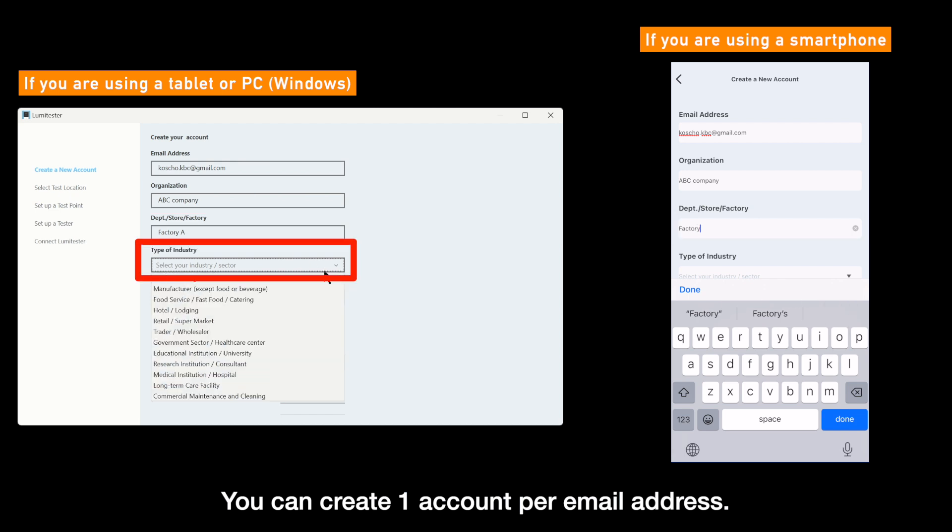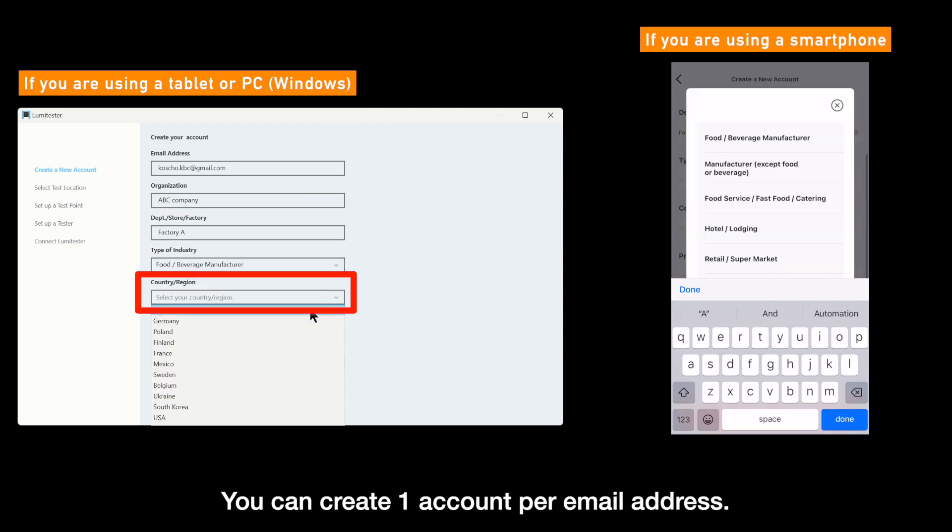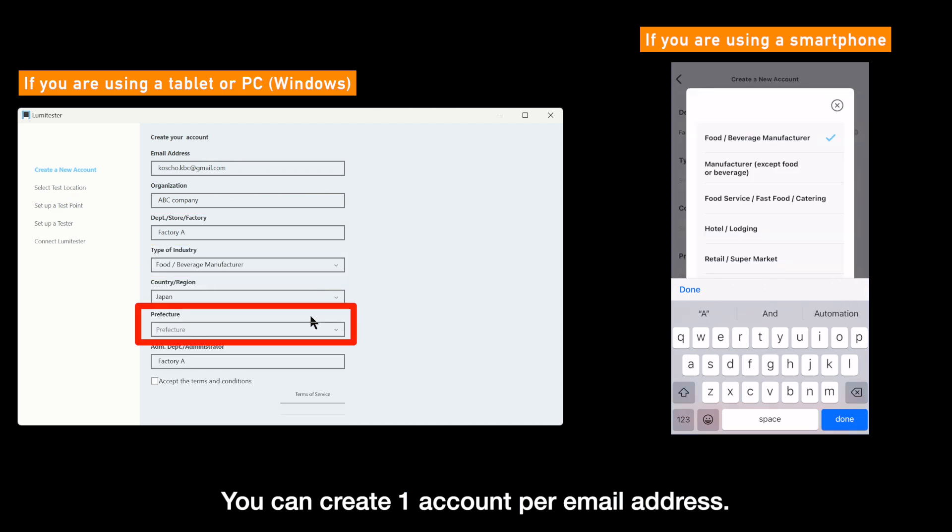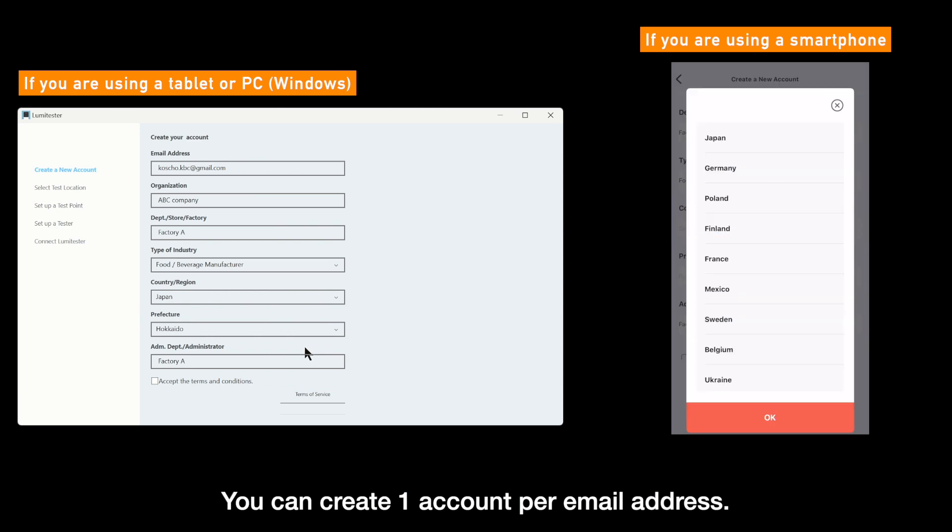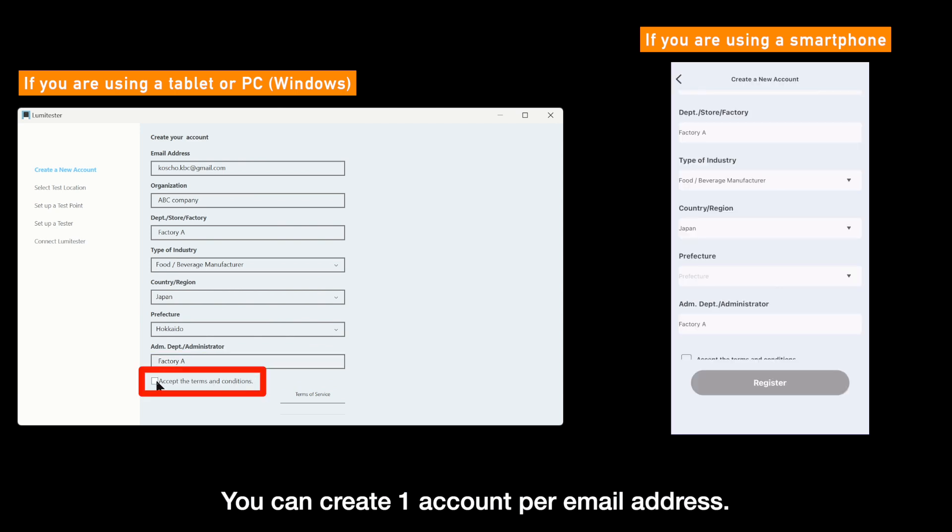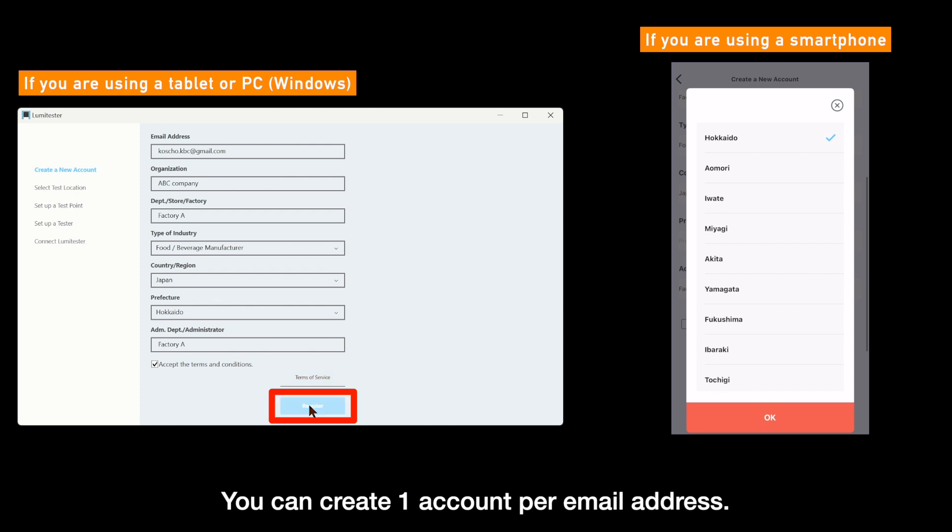You can create one account per email address. Check, accept the terms and conditions, then click or tap register.